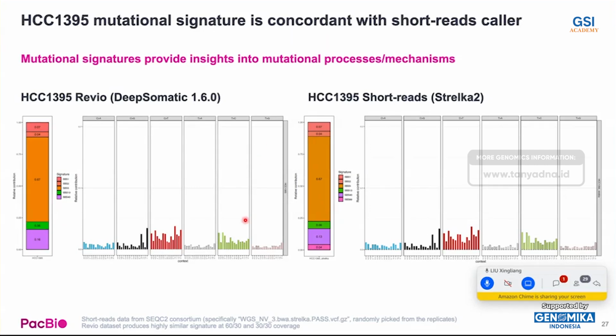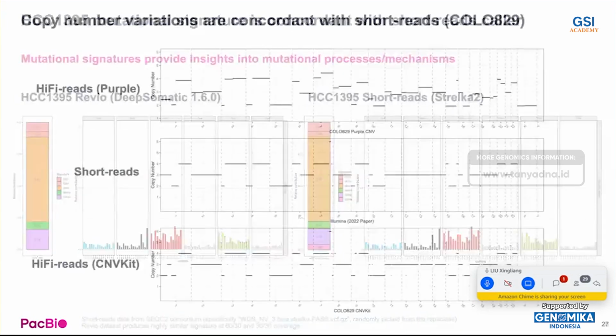One more thing I want to bring to the table is that, although we can only compare to the short read sequencing data, I believe that because HiFi sequencing can sequence more challenging regions, for example tandem repeats and segmental duplication regions, we can detect more SNVs, so we should be able to have a higher resolution mutational signature decomposition in real sequencing datasets.